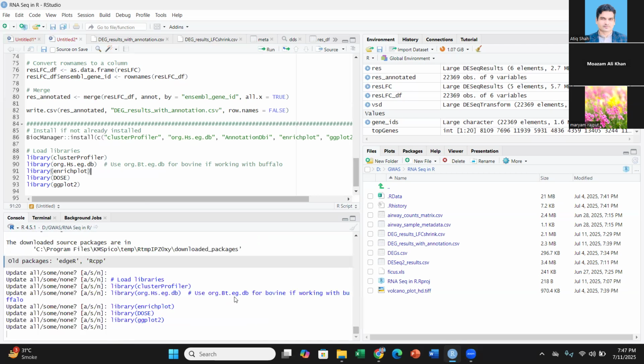Okay, here you need to update these packages.